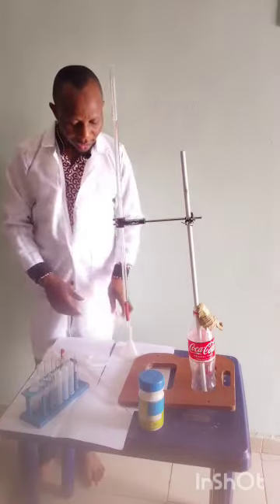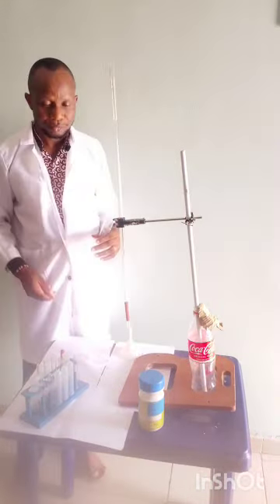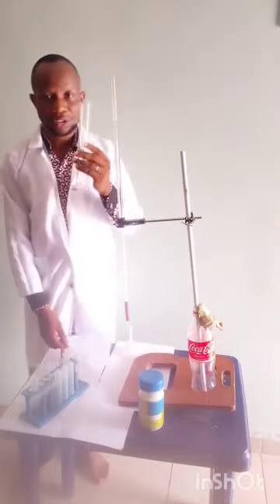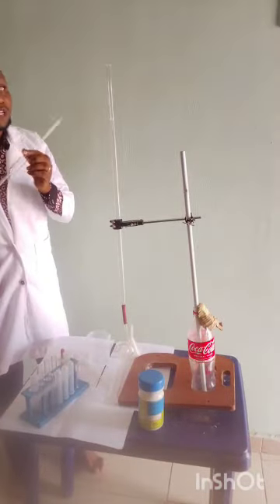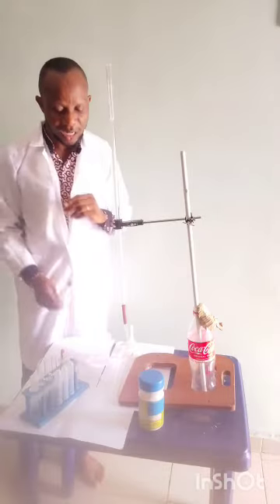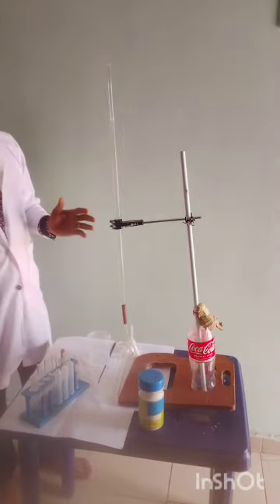So in a situation where you don't have a pipette, you can use a measuring cylinder for your measurement, but it is advisable to use the pipette because error has been minimized using this.